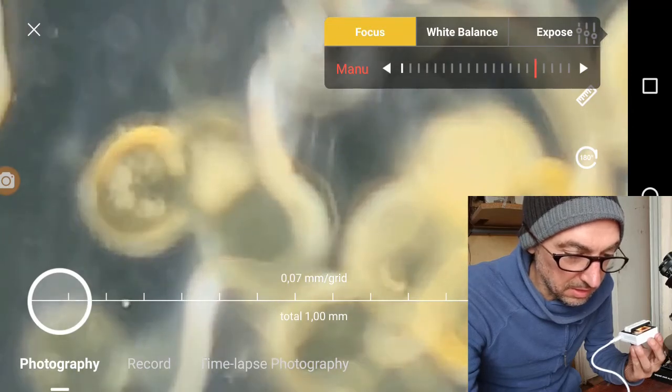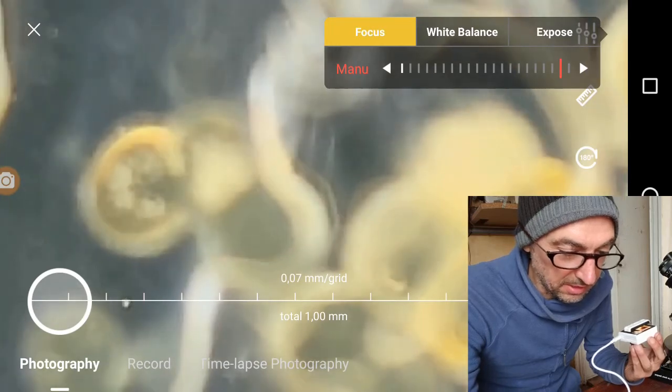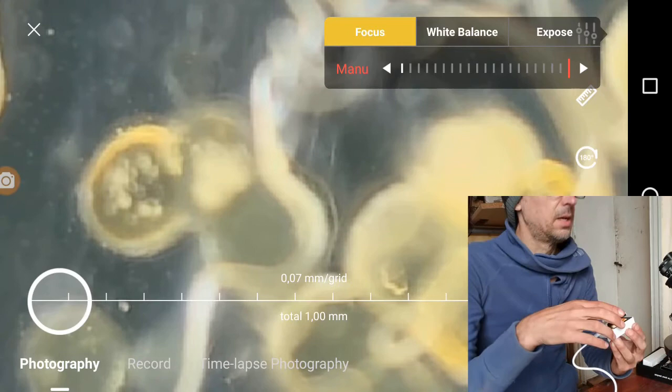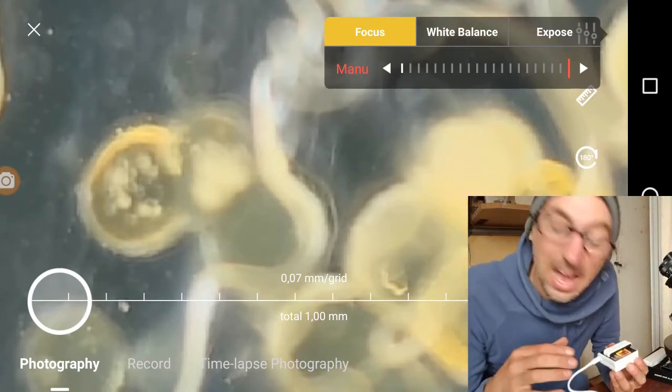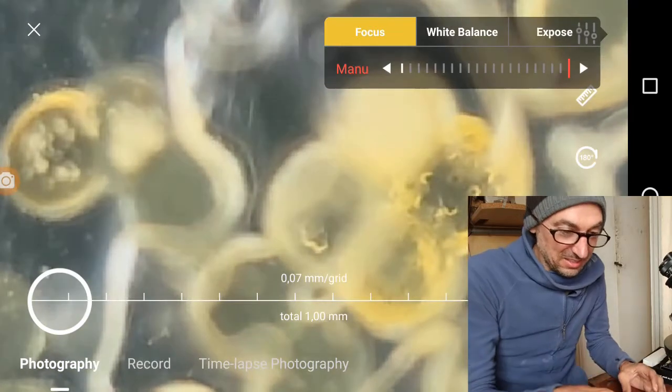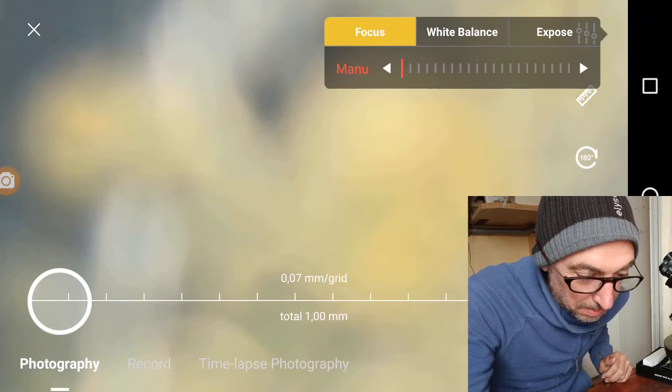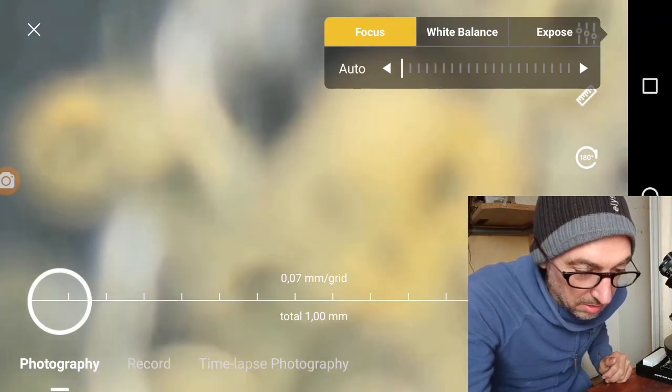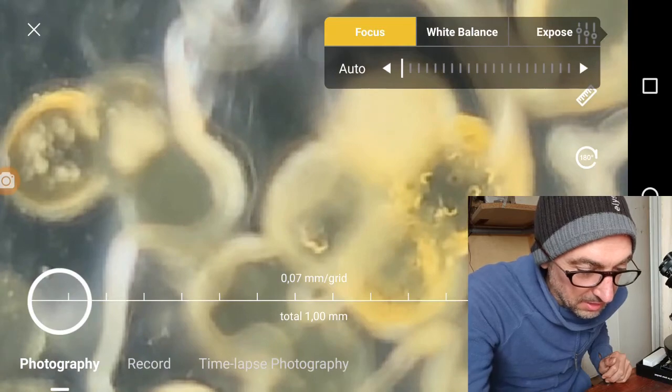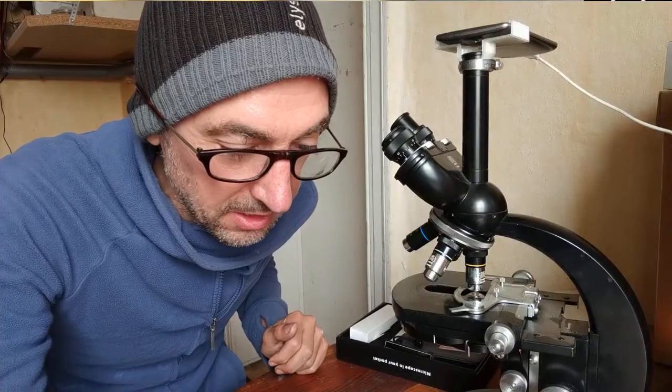Also because of these presets - I haven't tried my own samples. Recording stopped somewhere. I just want to show you, it's really showing these nice spikes in both manual and automatic mode. I'm really confident this can be used out in the field.